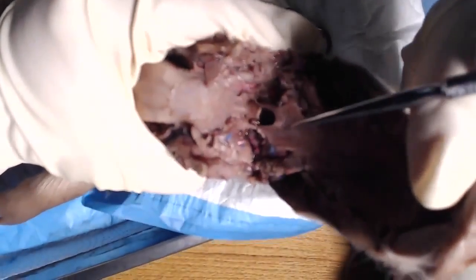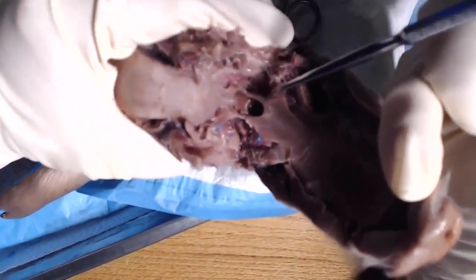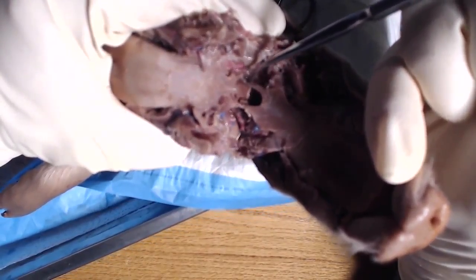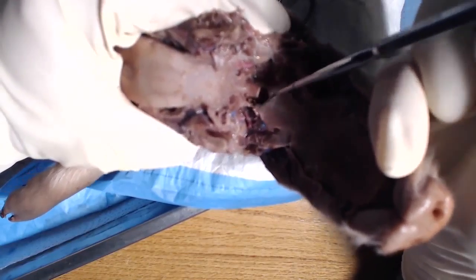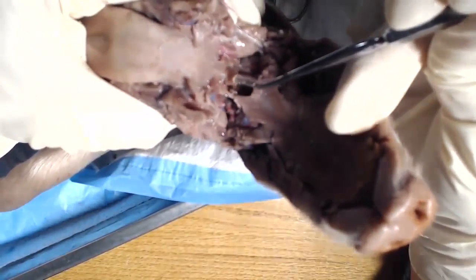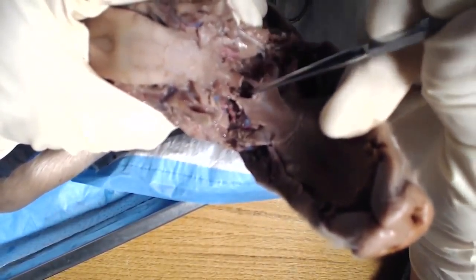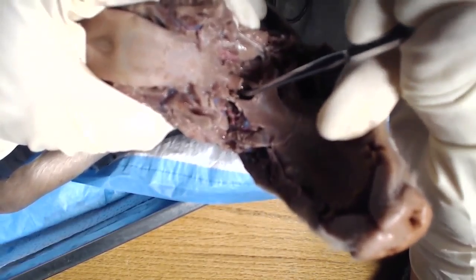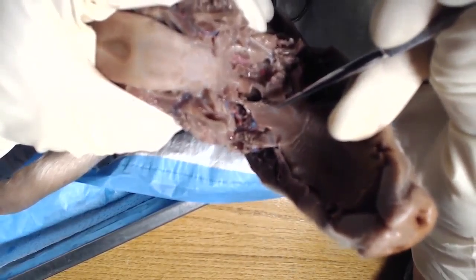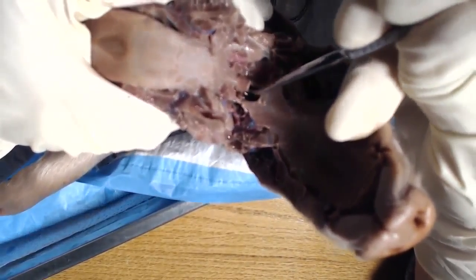So I'll try and point to it here. So here we have epiglottis. See if this camera will focus for me. Here we have epiglottis. And then here is our esophagus, this hole here. That's leading down into our esophagus, which is going to take food to our stomach.